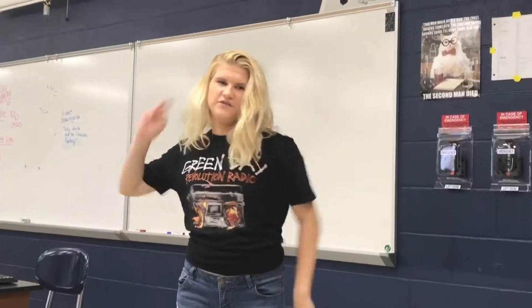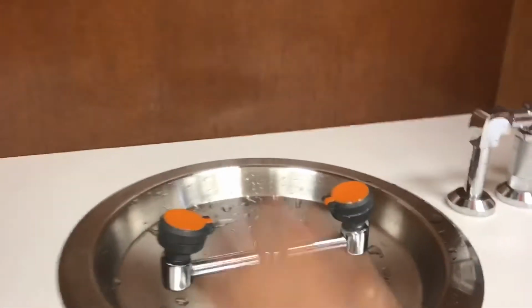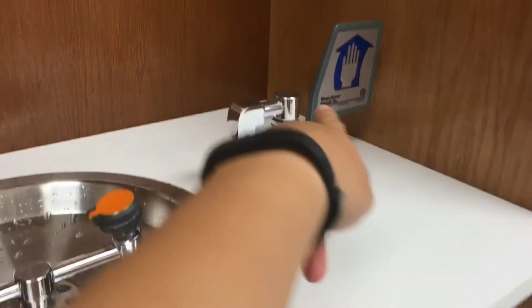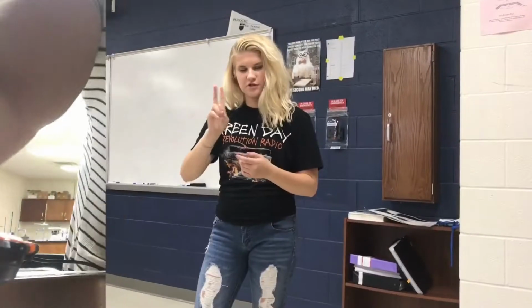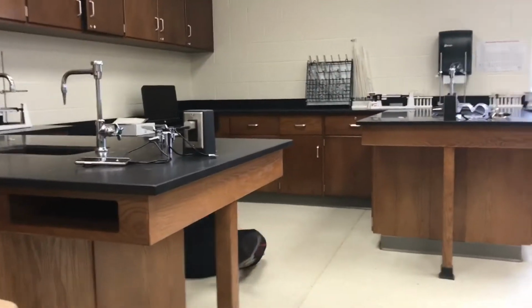What if an emergency occurs? Number 1, you get chemicals in your eye. You rush over here, put your face down right here, then you turn this water faucet. Demonstration, please. Number 2, if the chemical is swallowed or ingested, oh no, she's choking! I'll call the SDS.